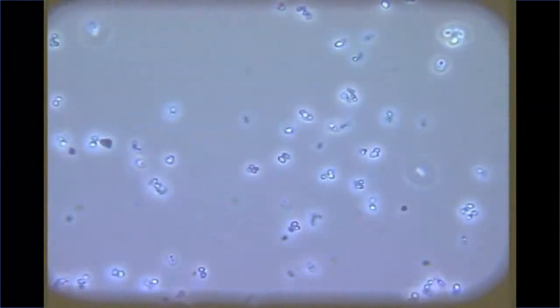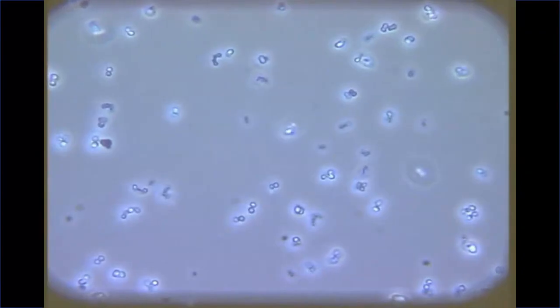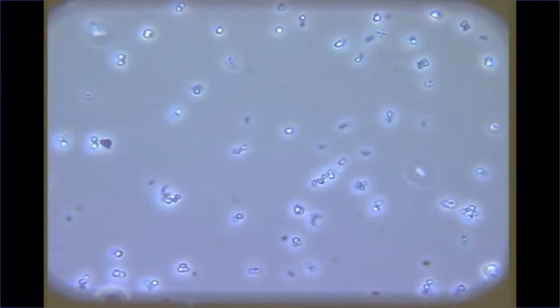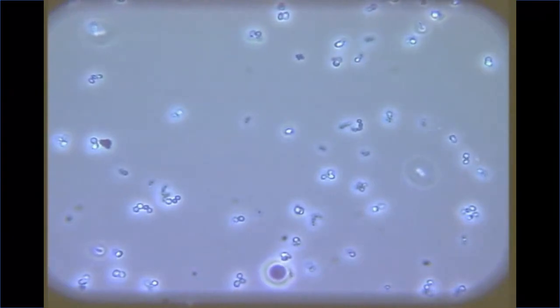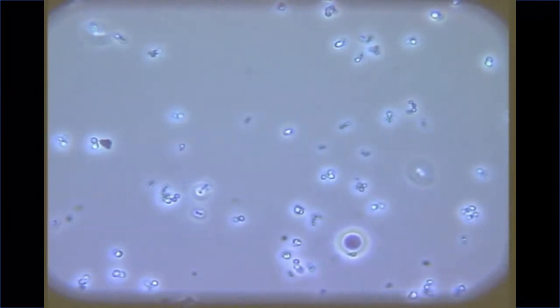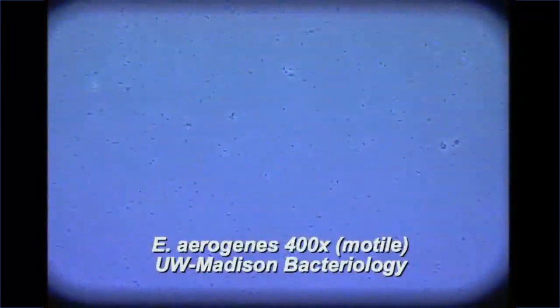And here we're seeing them under the oil. And you can see little clusters. So that's a hint, right? Clusters. Are these motile or non-motile? Probably not motile. Right, so non-motile, what you're seeing is just Brownian movement, right? Random vibration with a slight current, moving to the right.